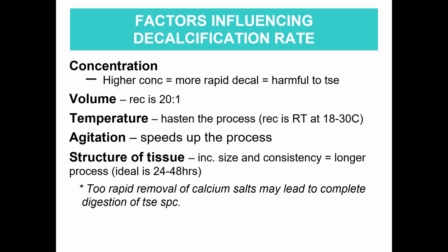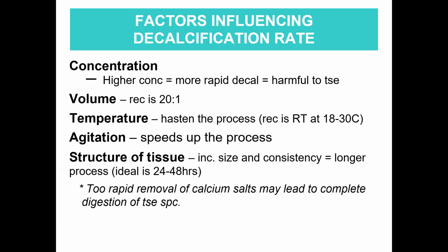So also remember that too rapid removal of your calcium salts may lead to complete digestion of your tissue specimen, or what we call the maceration. Okay, so that ends your decalcification.